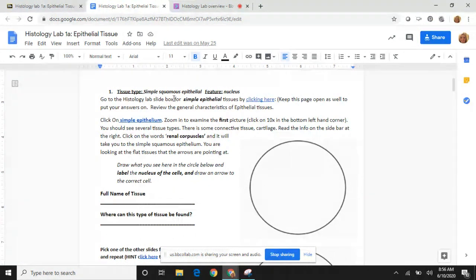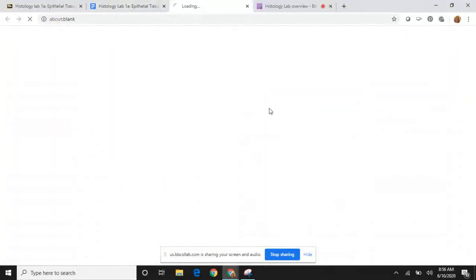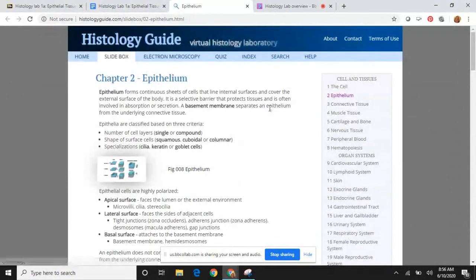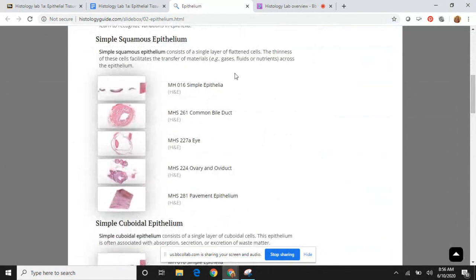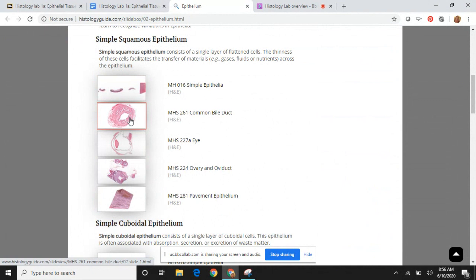So I want to show you how this assignment works and how to use this website. You're going to click where it says 'click here' — it's kind of like using a microscope. This takes you to the chapter two section on epithelium, and this is where I want you to read the information on screen. You can also come back here and explore different slides.